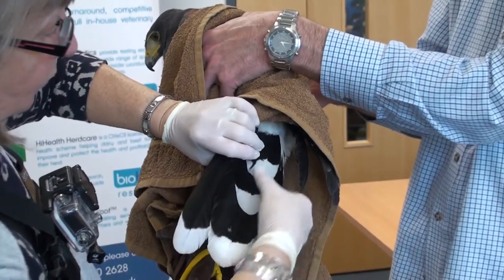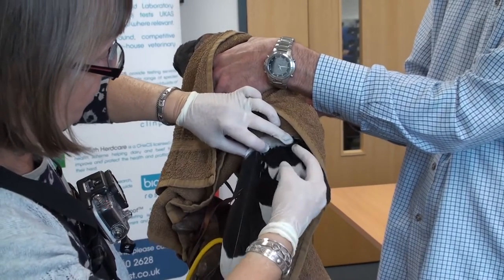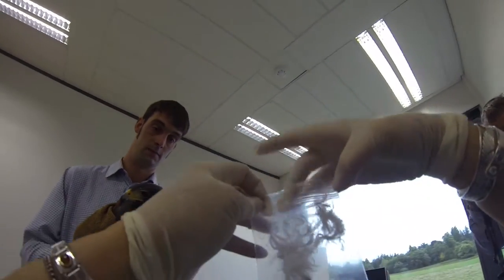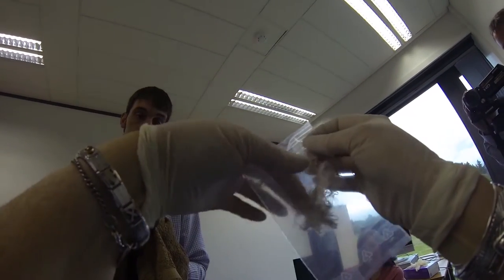Primary, secondary, or tail feathers are also not suitable, as plucking these will cause considerable pain to your bird. We will process at least three feathers in the first instance; however, more feathers allows us to repeat the test if needed. If feathers are very small and fluffy, please send more than three.